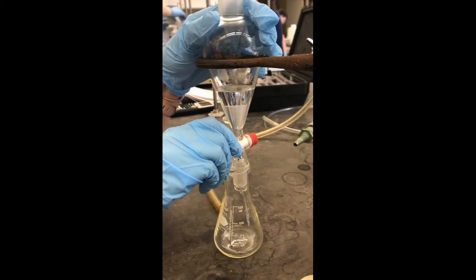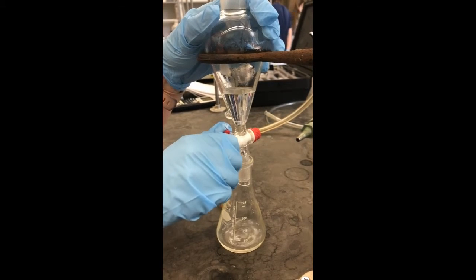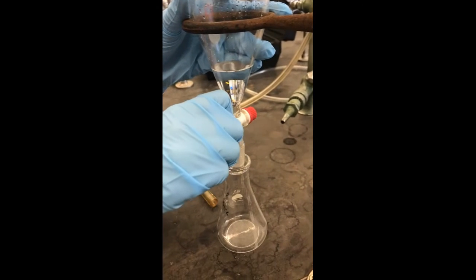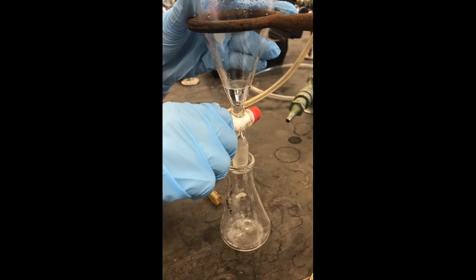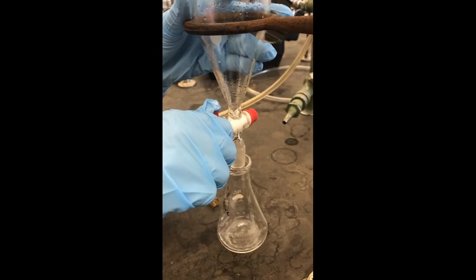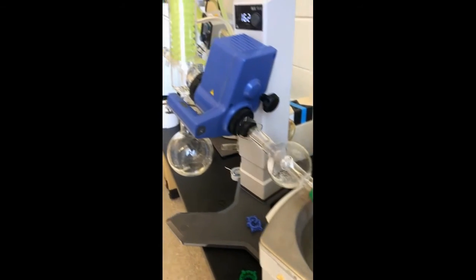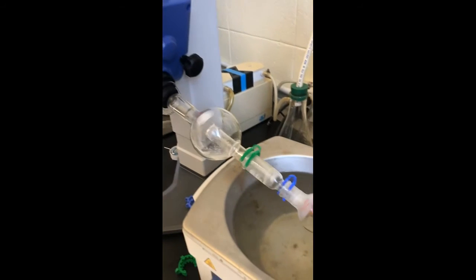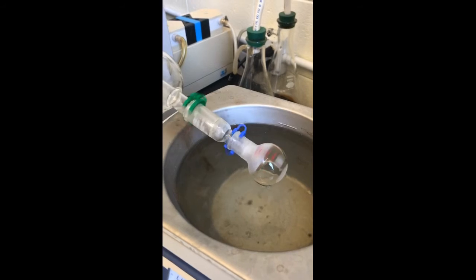The aqueous layer was returned to the funnel and extracted with 10 milliliters of diethyl ether for a second time. The aqueous layer was once more removed and the 2 diethyl ether solutions were combined and washed with 10 milliliters of water. The aqueous layer was collected again and a final wash was completed with 10 milliliters of a brine solution. The diethyl ether solution was transferred to a separate flask, dried with magnesium sulfate, and filtered. The solvent was removed using a rotary evaporator and a final product was made.